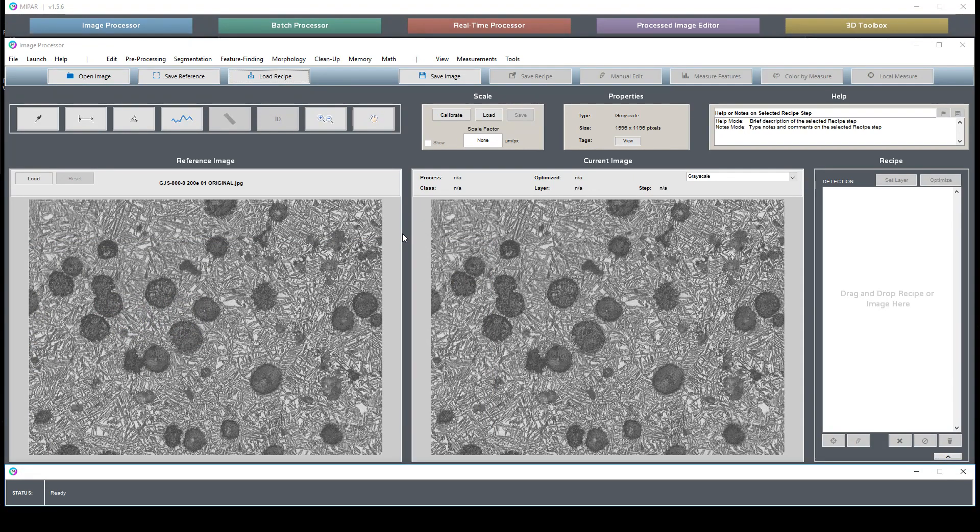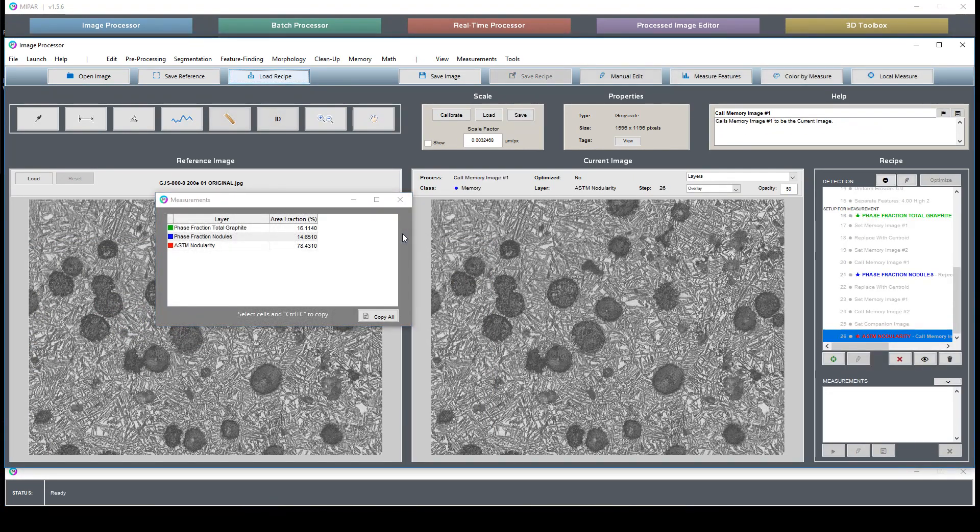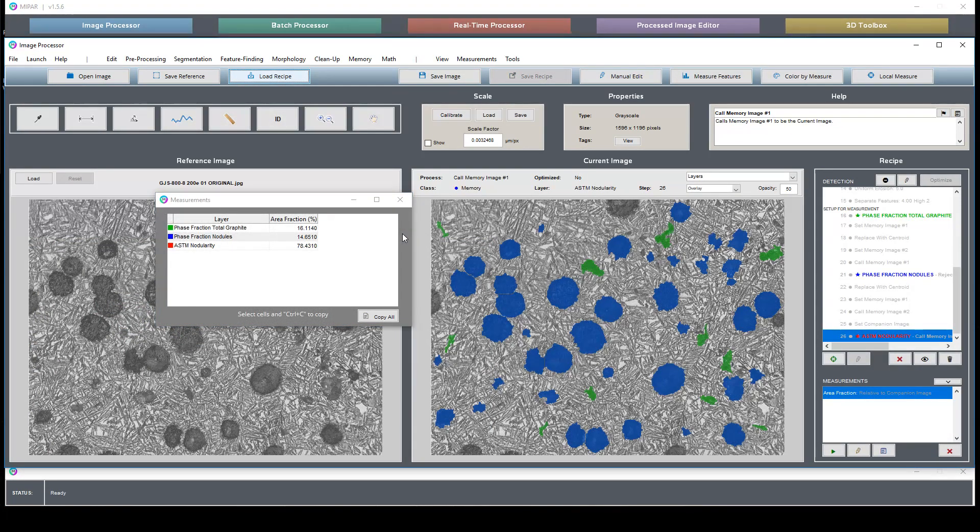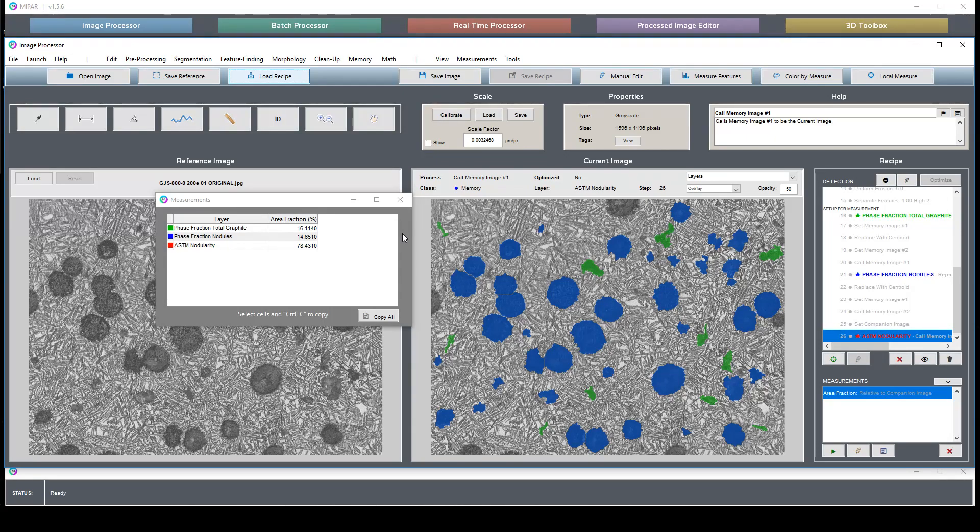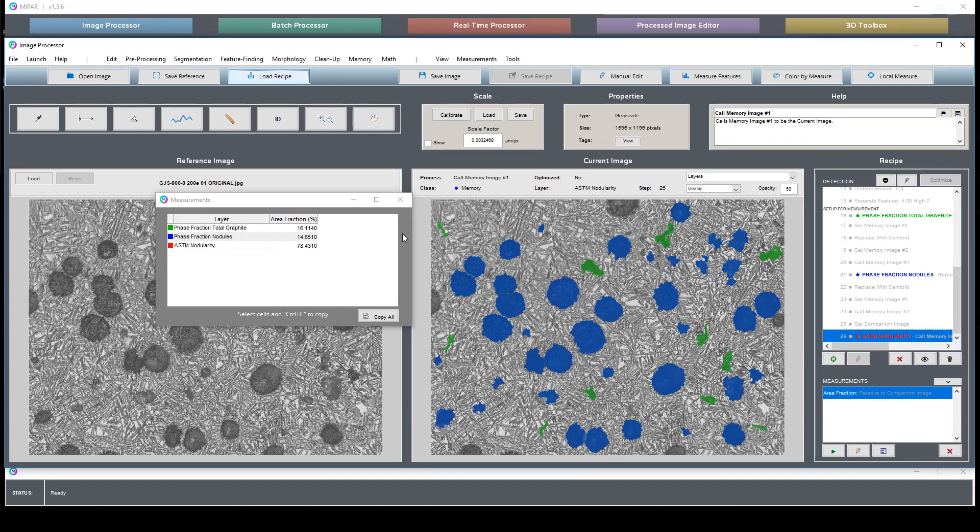This recipe is first loaded, it's going to report three things. It's going to report the phase fraction for the total graphite, the phase fraction of the nodules, and an ASTM nodularity. All these are reported as percentages.